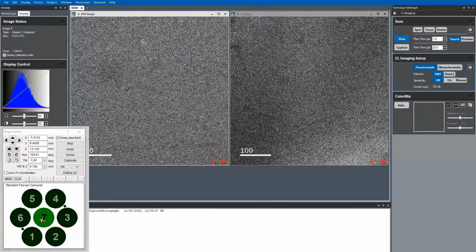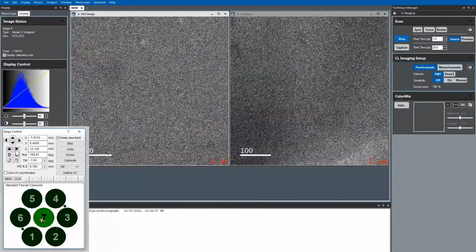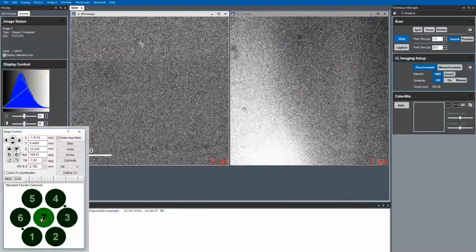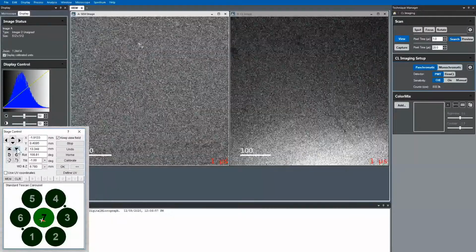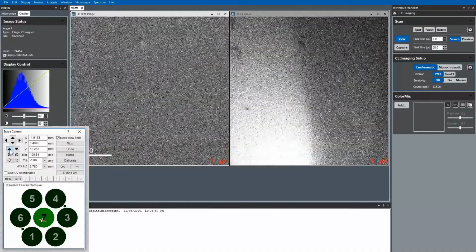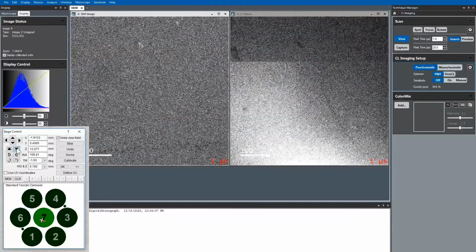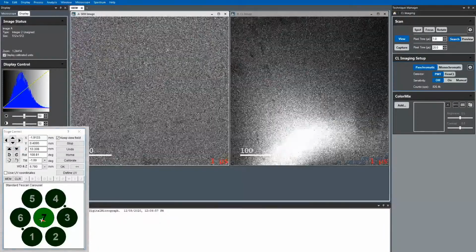So that was the point I want to find and show you guys. So I've gone up through it. I need to come back down. You see this bright region? It looks like the center of the focal point is maybe off a little bit. But what I want to do is maybe even if I mag down.